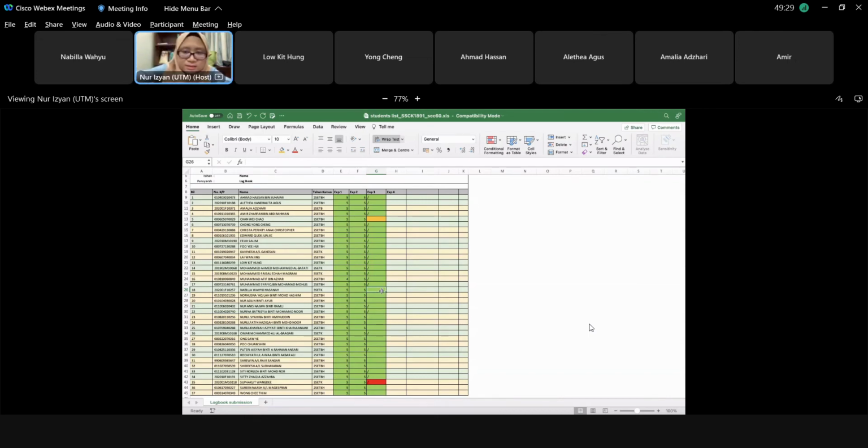Okay, maybe I can ask your other colleagues to help you. Nur Husna Akila, can you help Nabila Wahyu? Why do we need to turn on the fume hood while operating the AAS machine? I think to prevent the hazardous substance. Okay, to prevent the hazardous substance from. Very good. Your sentence is not yet completed.